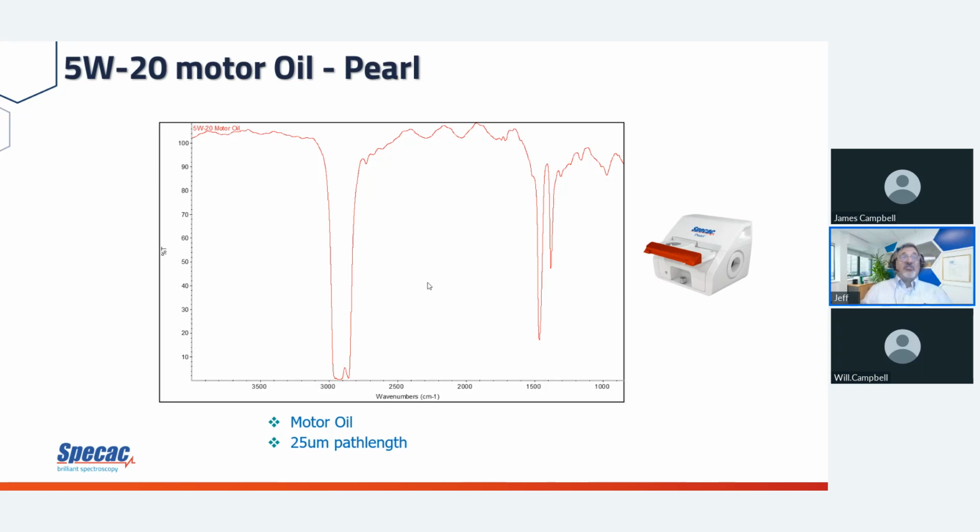I didn't have a chance to name the accessory. That was done before my time. I'll show you the oysters in a little bit, but you can separate those out, which is great because then you can really clean it up. You wipe off the grease with a cotton swab first to get the bulk off, then go in with a solvent that will remove the oils or the grease or whatever you're doing. You can even use water, alcohols, whatever is going to be convenient.